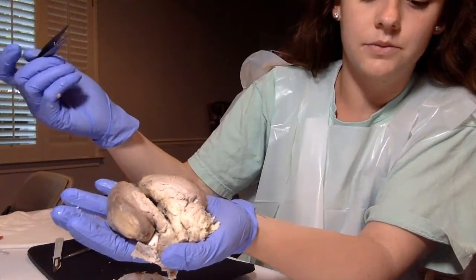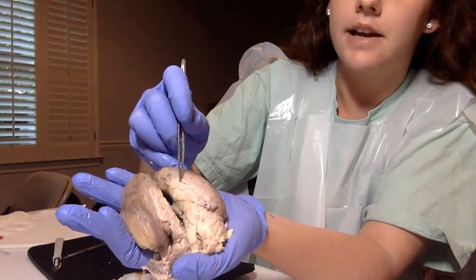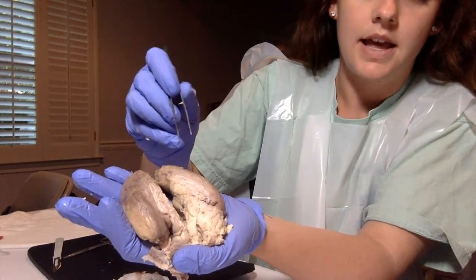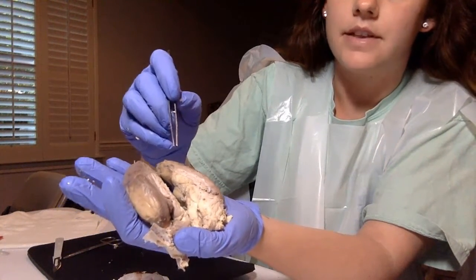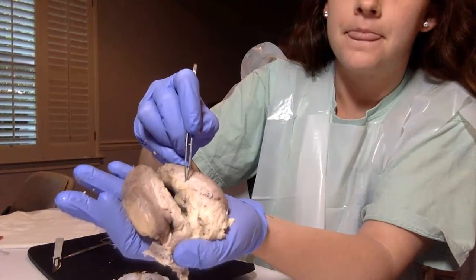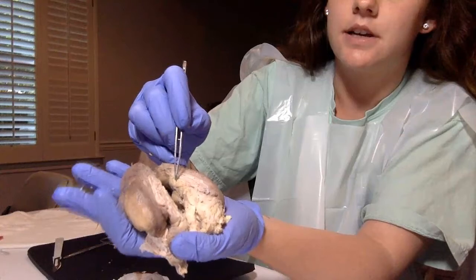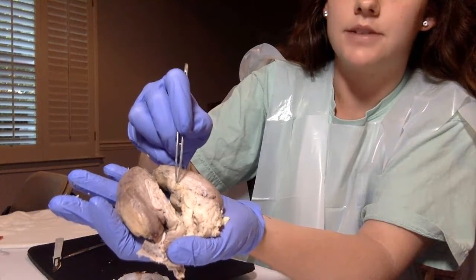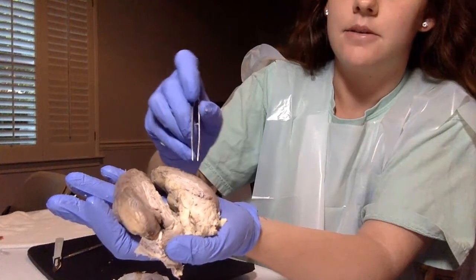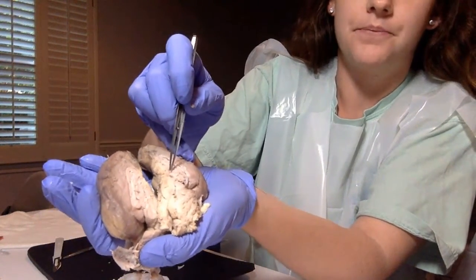So first we have the corpus callosum, which is right here, up, kind of has a groove going in, and then we have the thalamus, which is below it, right here, and then we have the hypothalamus, which is farther inside, but also still close to the thalamus. Then we have the midbrain, which is down closer to the middle of the brain.